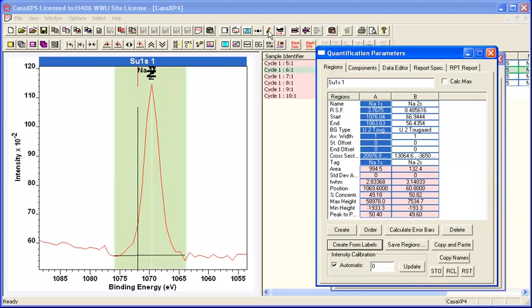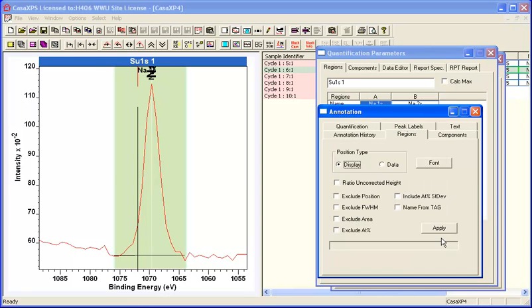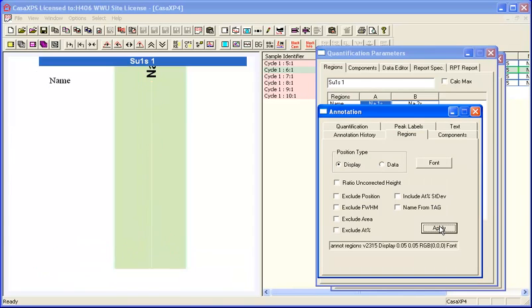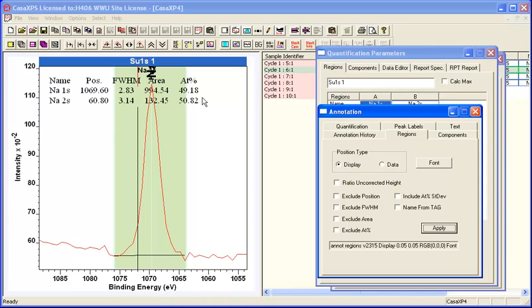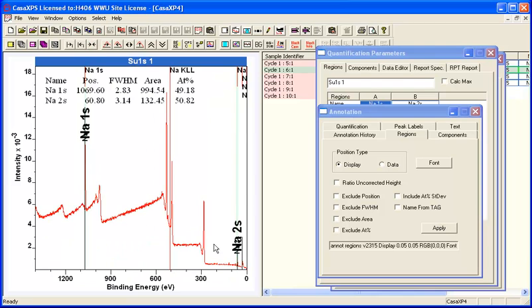We'll bring up the annotation again and put up a region quantification. That's very reassuring. We have sodium 1S and sodium 2S at opposite ends of the kinetic energy range, and we've got a one-to-one relationship. So this looks like a valid measurement.